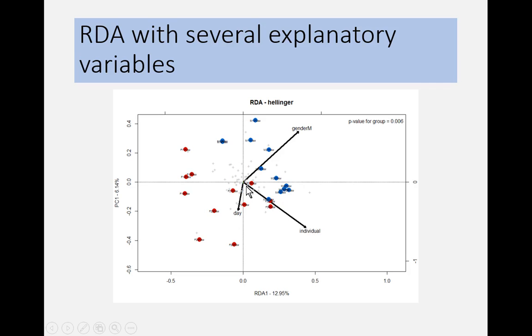You can basically try to figure out how those dots here, these samples, fall along these explanatory variables here. What you see, for example, if you plot every one of those dots on here, they should be perpendicularly projected, so you can see in which order they fall. This is actually pretty hard to do on the computer screen, but anyway.